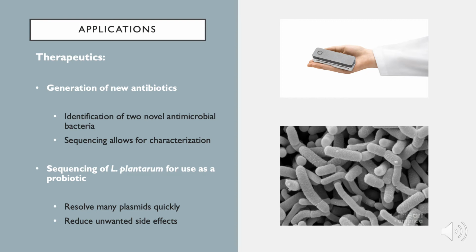Another useful application of the Oxford Nanopore's MinION was in the sequencing of Lactobacillus plantarum, a probiotic that has proven beneficial but has unwanted side effects in some people. The sequencing of this bacterium has been difficult in the past because of its unusually high number of plasmids. The MinION was used to resolve these plasmids and successfully sequence the bacteria. This information may lead to a better understanding of this probiotic.